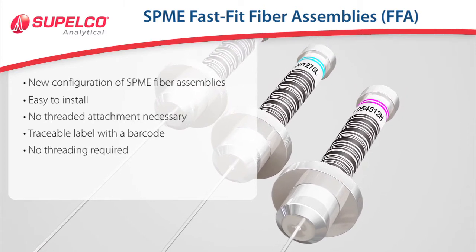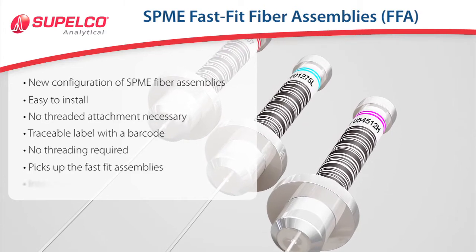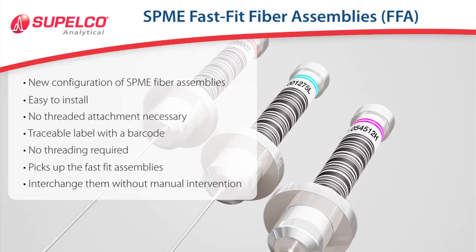The Auto Sampler Multi-Fiber Exchanger can pick up the Fast Fit assemblies and interchange them without manual intervention.